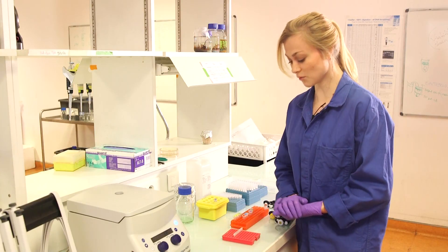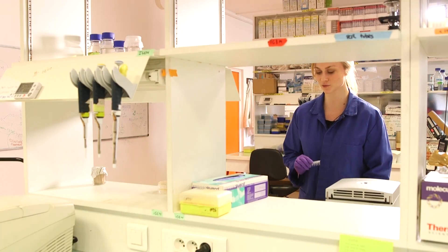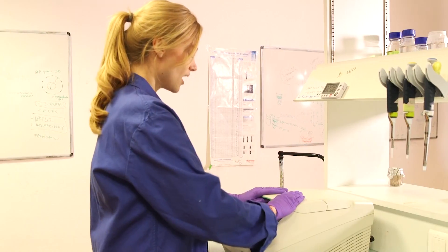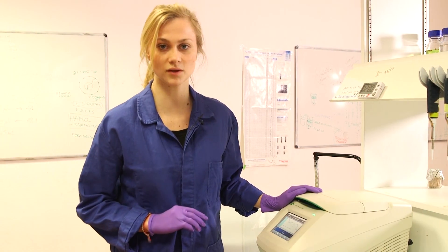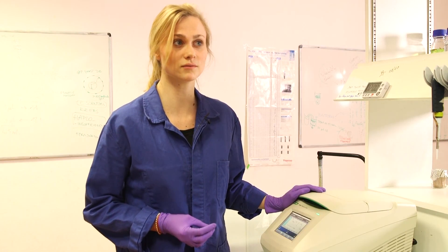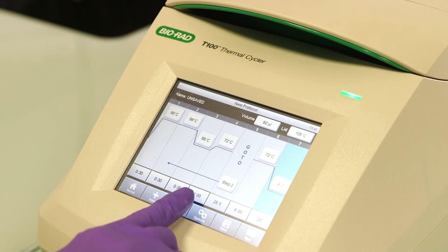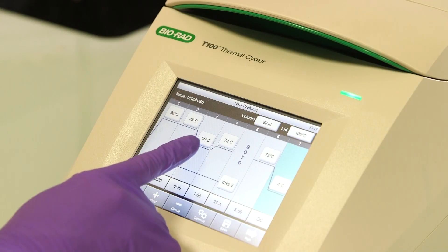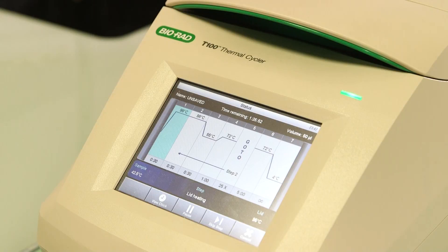Now we have prepared our samples and we can move them into the PCR machine. Our beautiful samples are ready for their special PCR treatment. I'll place them in the machine. There are two important things to mention when setting the temperature: one is the extension time needed for your polymerase — in our case we have a pretty fast enzyme, about 15 to 30 seconds per 1 KB, and our fragments are around 2 KB, so I've put one minute for that step. Another thing to keep in mind is the annealing temperature of your primer — 55 degrees Celsius is good in our case, but if you have different primers you might want to change this. So let's go — press start, and the only thing we have to do is wait until the reaction is finished.